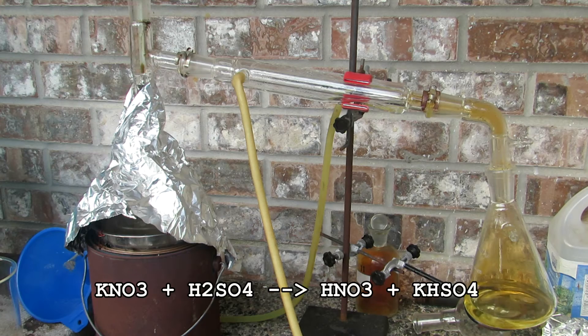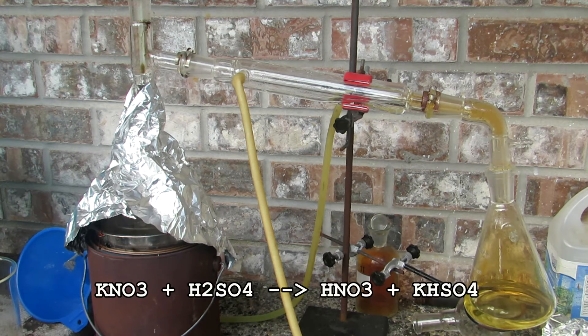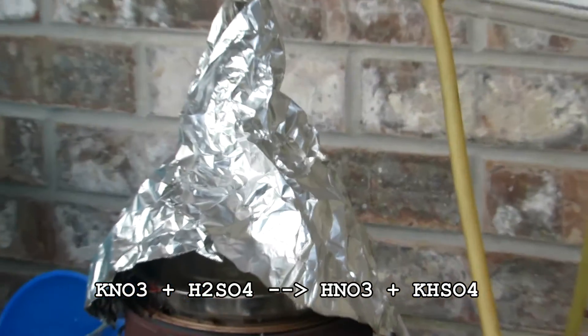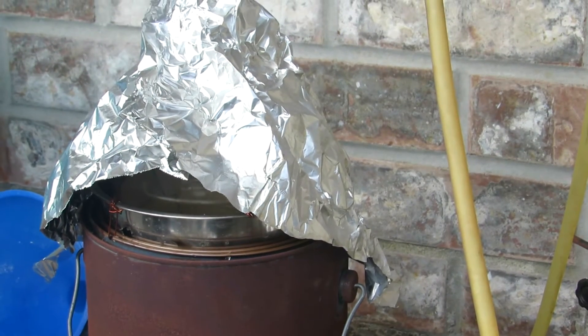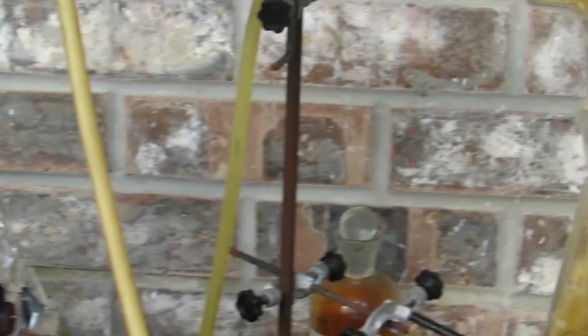As you can see, the sulfuric acid is reacting with the potassium nitrate to form the nitric acid. This is boiling around 121 degrees Celsius, and you can see we're collecting our 68% azeotrope in the flask to the right.